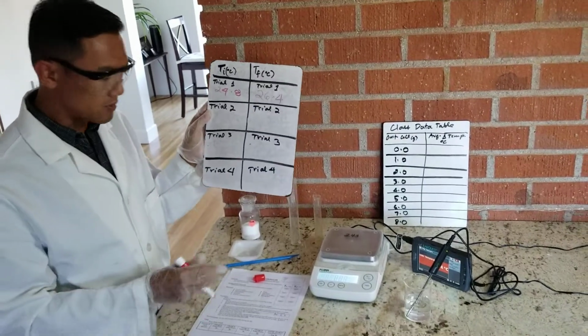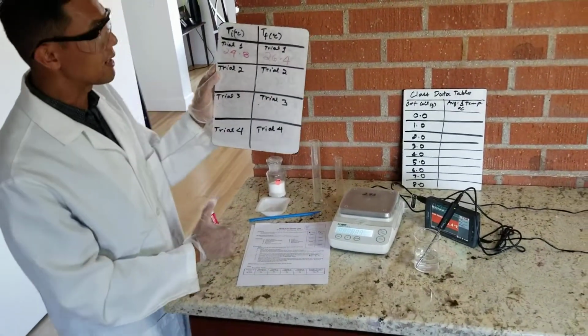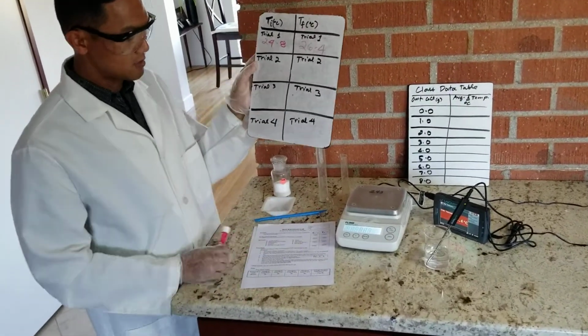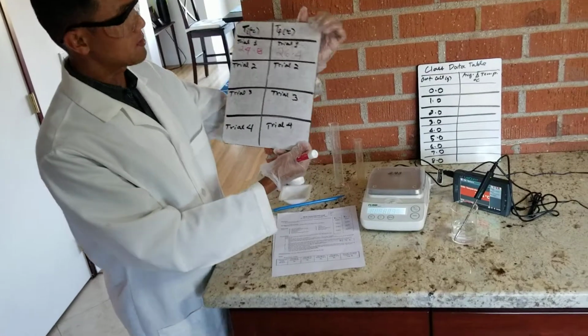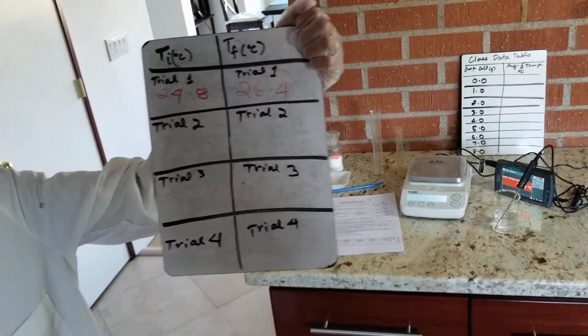The next step is, if we were doing this in class, you would be asked to repeat this trial multiple times. So now, based on previous data, I'm going to record some of the numbers here.